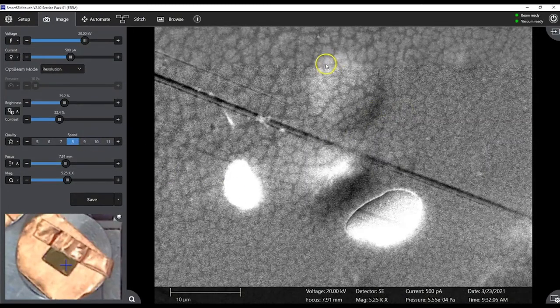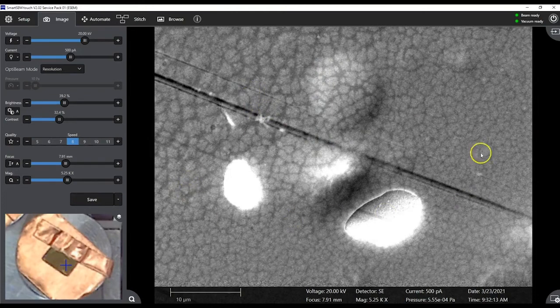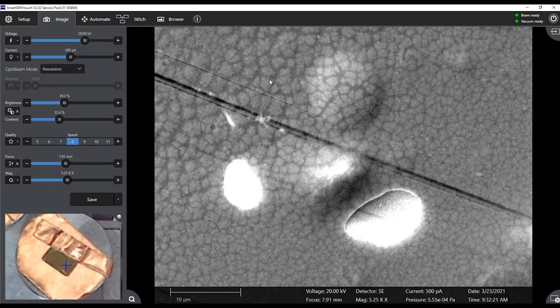You see the line here scanning down at a lower rate, but this looks so much clearer, and now you can really see what I'm saying here when it kind of looks like skin. If you take a close look at, say, the back of your hand, all the little cracks and grooves in there, it very much looks like skin.